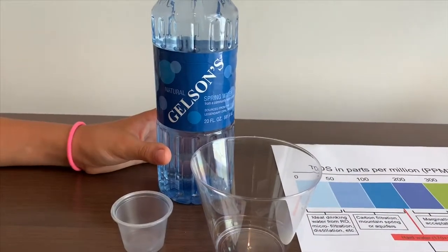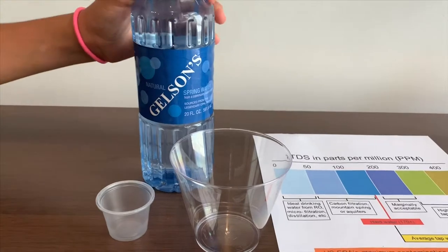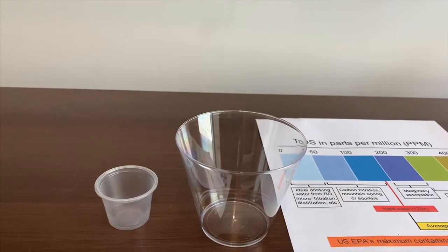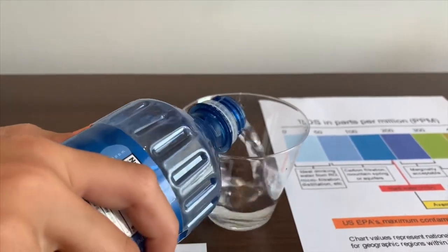This is Gelson's natural spring water. We got it from Gelson's and it cost 70 cents. Let's pour some in and test the pH level and its TDS level. First we're going to do the TDS level, then we're going to do the pH.